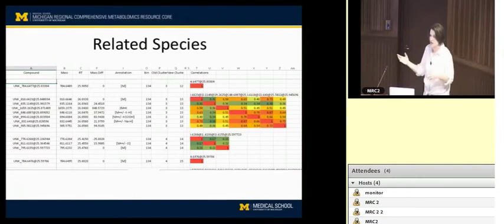And so unless you control for age and or adjust your data for age, you won't see any separation just based on diet alone, for example. So if you don't see a result in the PCA plot, then you have to start digging further and further down to say, okay, what could it be that's masking my signal in what I think that I should be able to see a difference in, for example.